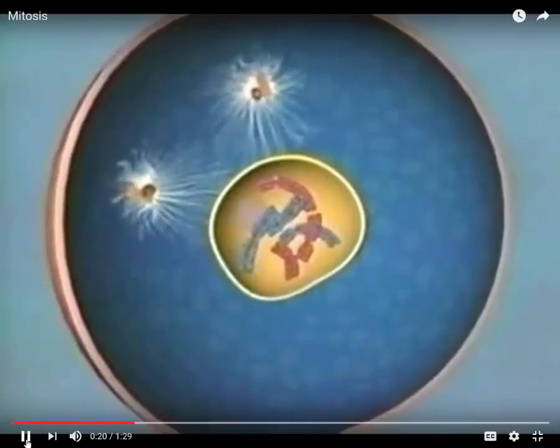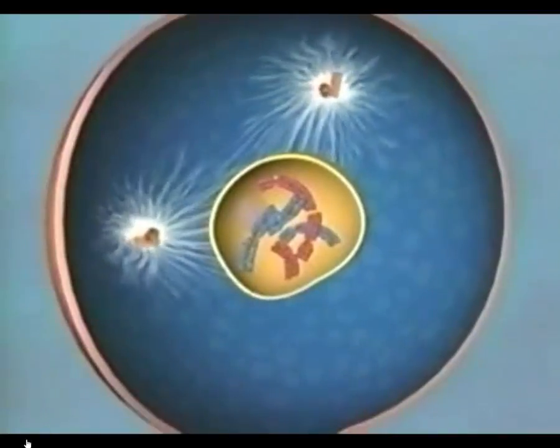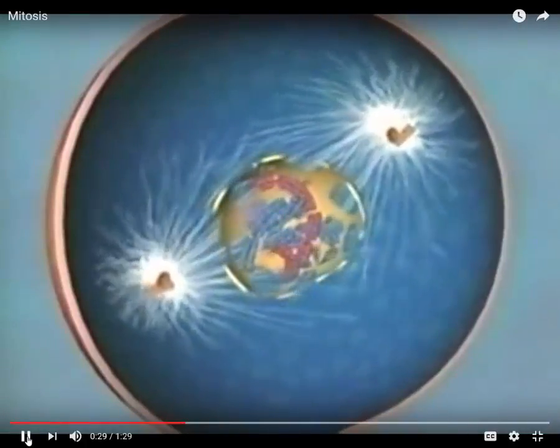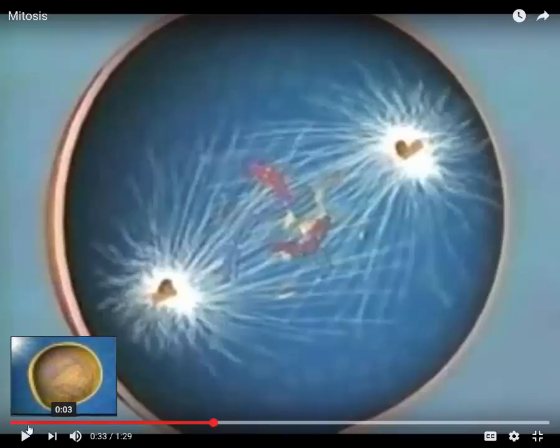Meanwhile, protein fibers grow from the migrating centrioles, forming a latticework of spindles. For reasons scientists don't fully understand, the nuclear membrane suddenly disintegrates. So this is prophase again. Again, we know nuclear membrane, centrioles are on either side. We can see chromosomes in the middle, but they're not quite lined up in the middle. They're just hanging out. And this spindle is being secreted by these centrioles, and the spindle is going to attach to the chromosomes and push them to the middle.